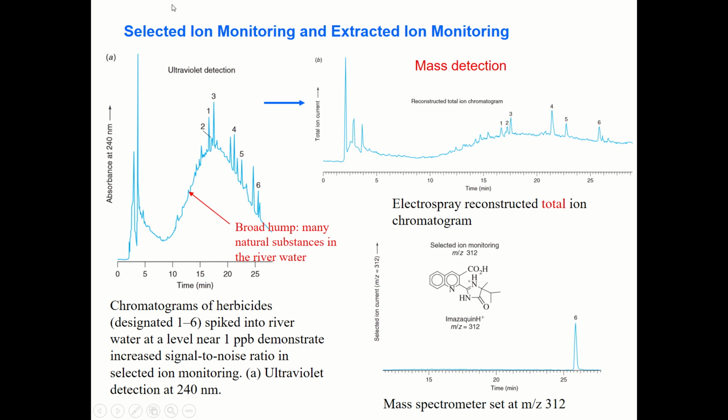Okay, next topic is selected ion monitoring and extracted ion monitoring.